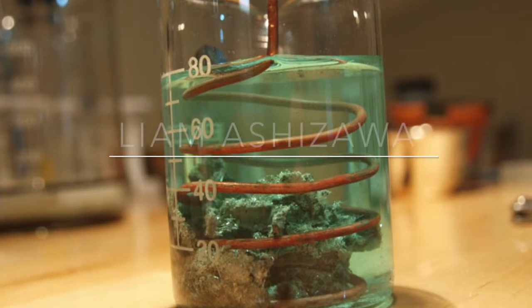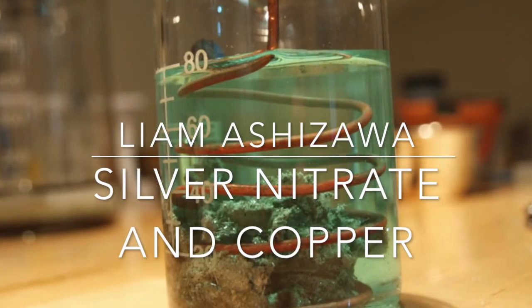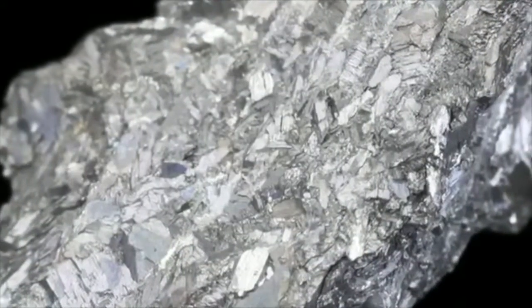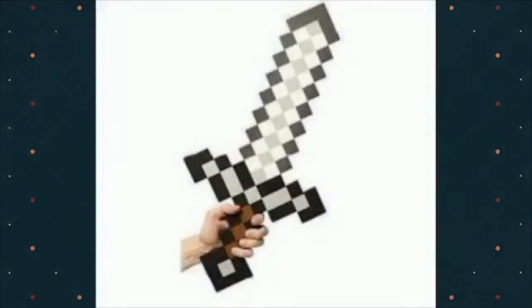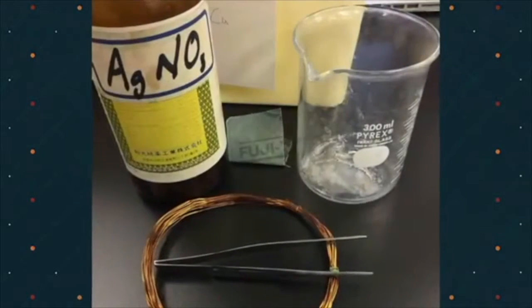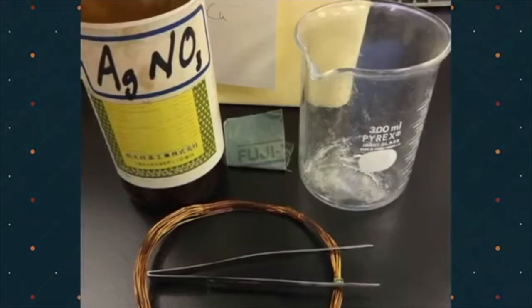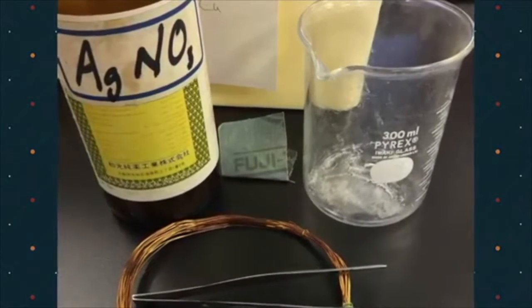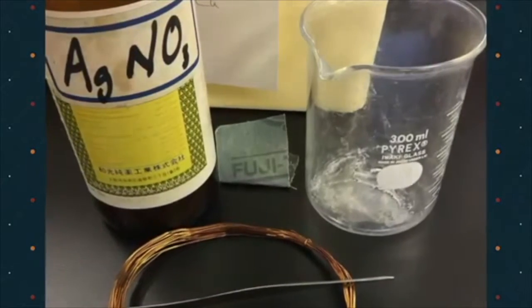Finally, Liam will be explaining the single displacement reaction of silver nitrate and copper. Have you ever wanted to make your own silver? Or have you ever wanted to make a real-life sword just like in Minecraft? Well, today I will demonstrate a chemical experiment that will help create pure silver. To start the experiment, you need AgNO3, or silver nitrate, copper wire, a large beaker, and sandpaper.